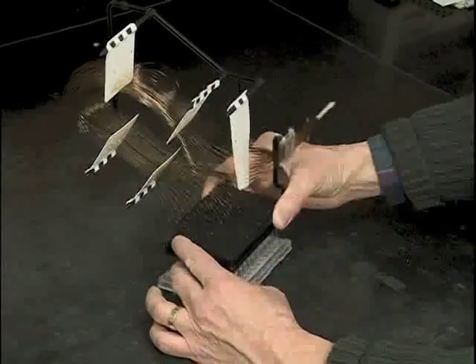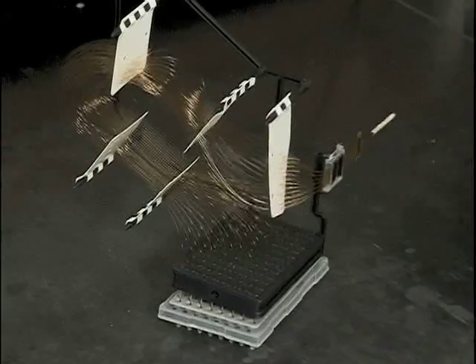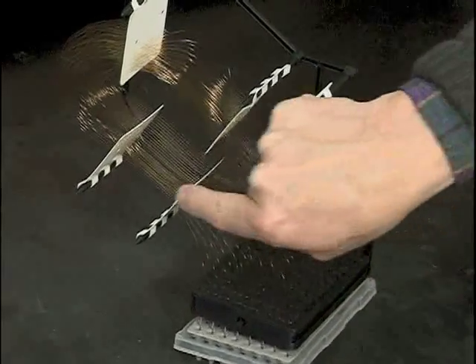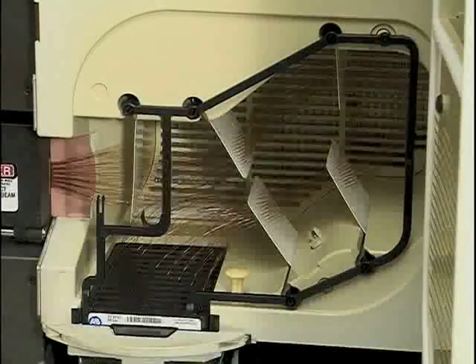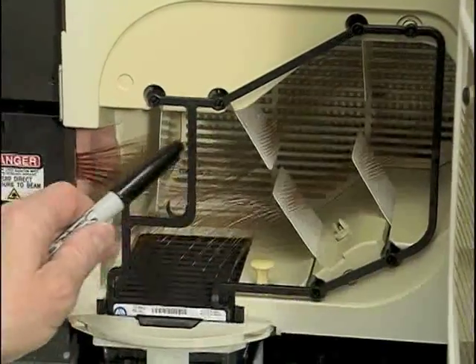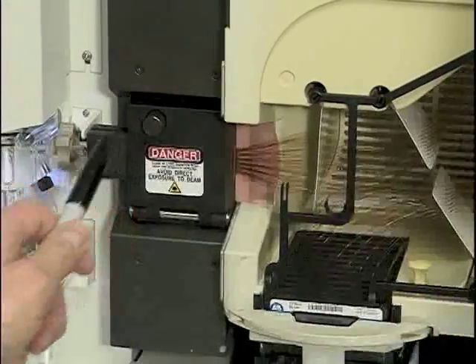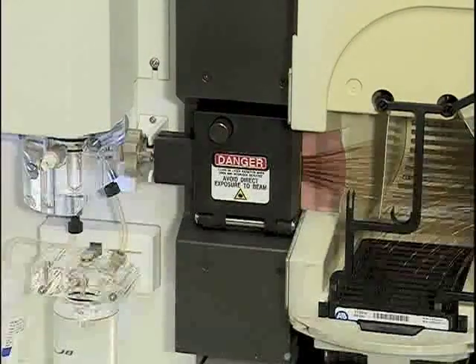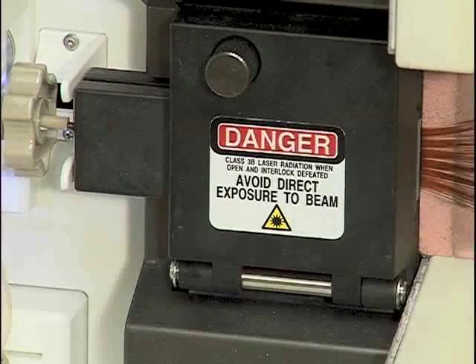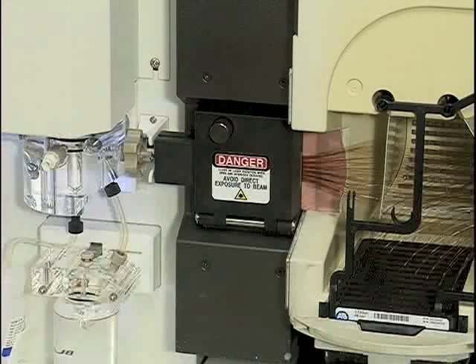Once the plate is in the correct position in the sequencer, the pins on the capillary array pierce the septum on the plate. A charge is applied, and a small amount of the DNA sample is pulled up electrokinetically into each capillary and electrophoresis begins. Here we can see the inside of the oven where the capillary array is mounted. The oven keeps the array at an optimal temperature for electrophoresis. The samples continue to electrophorese through the capillary, being separated by size. Eventually the samples reach the detection window, where the light from the laser excites the dyes attached to the terminator molecules, they'll fluoresce, the signals are picked up by a CCD camera, and the software does the rest — just like with the 377 slab gel sequencer.